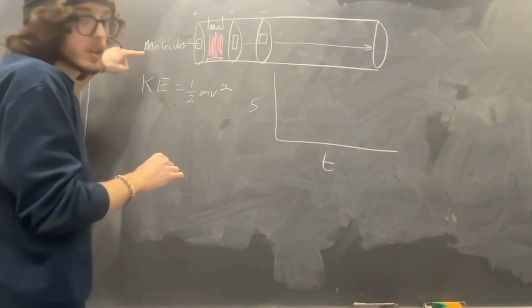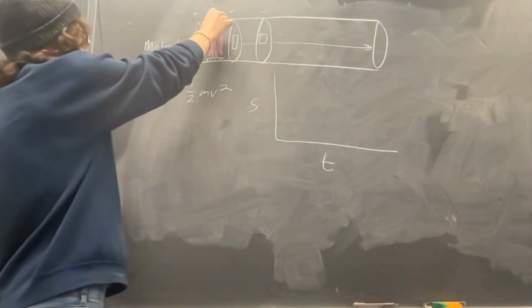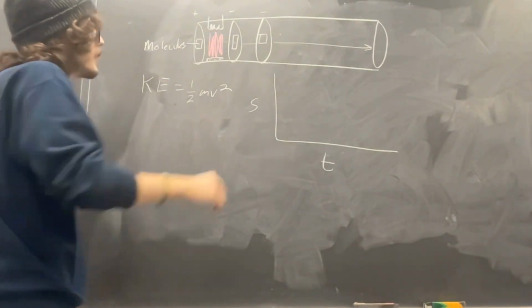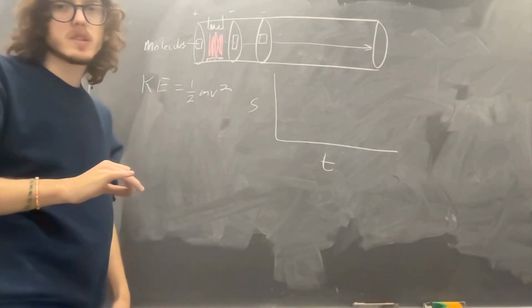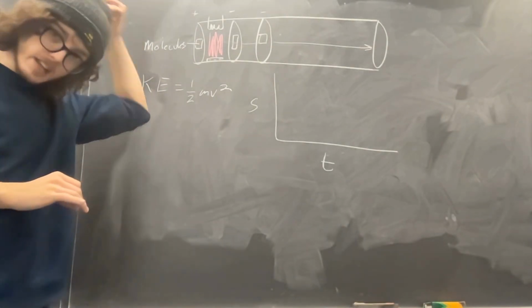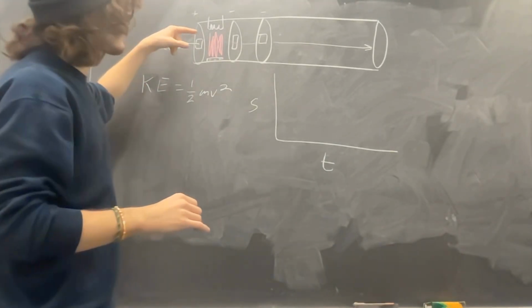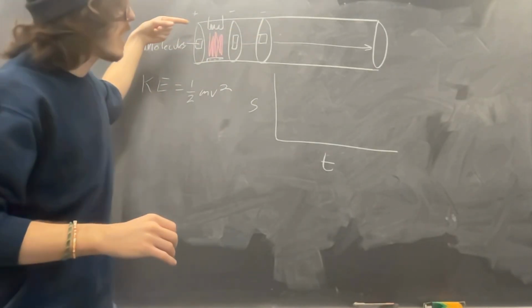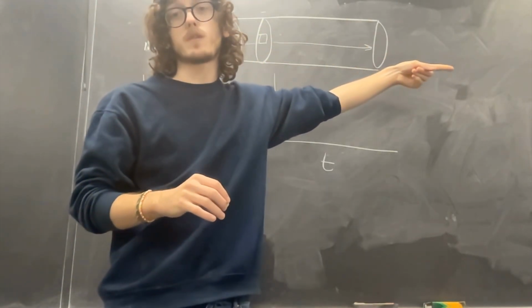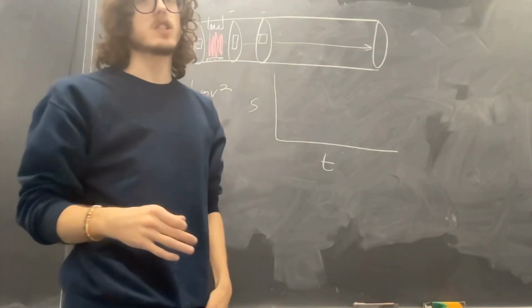So you have molecules that go into this electron chamber. Basically, electrons are coming off of this tungsten filament. They are striking down at the cathode, about 70 volts in between there. Those electrons ionize the molecules, and the ions are accelerated through these acceleration disks and a slit, and they go through this field-free region. This is the new part right here, the field-free region.